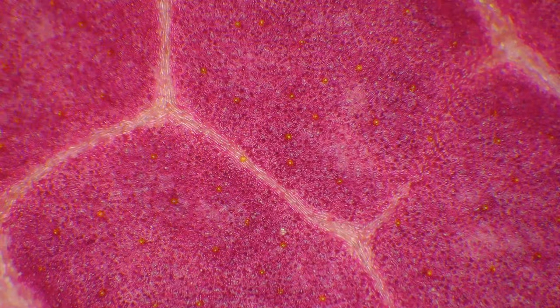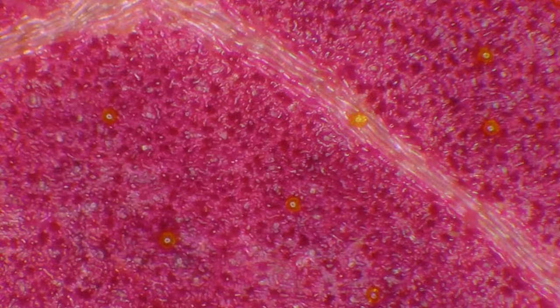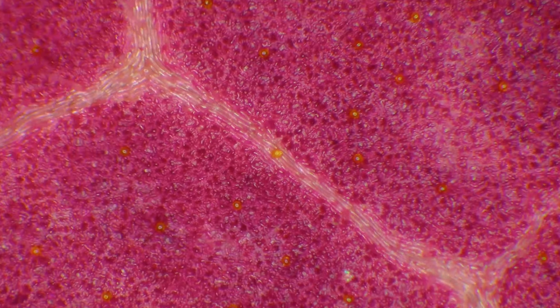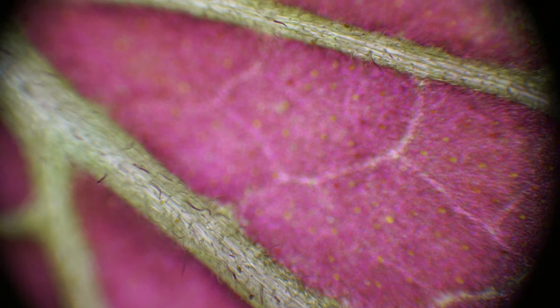Here when we zoom in we can see something that looks like small lights. We go two times digital zoom — the light goes much clearer. Try four times digital zoom. I think six times digital zoom. And here I think we actually got about eight times digital zoom. So here we have a bit sharper image.